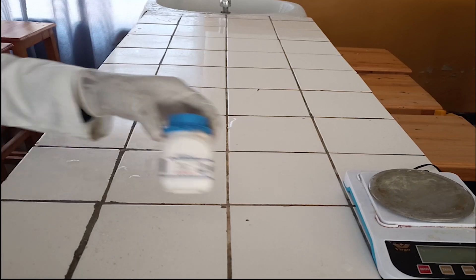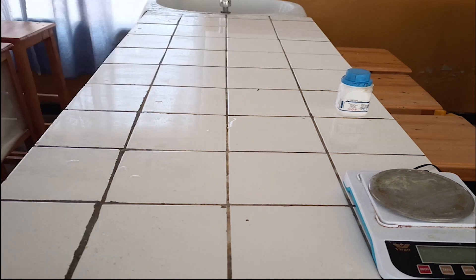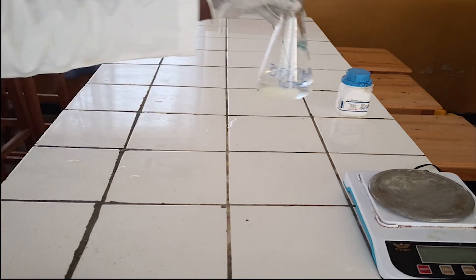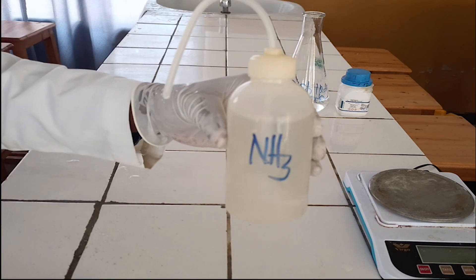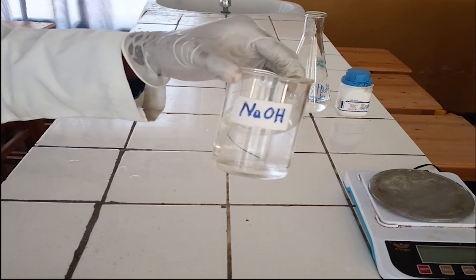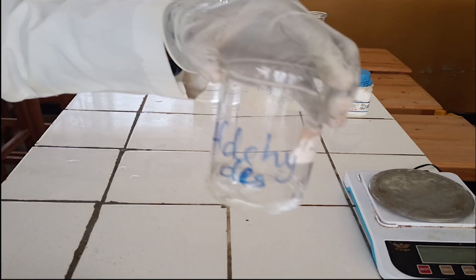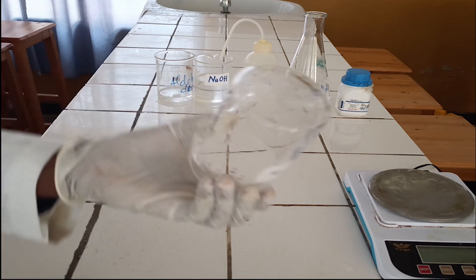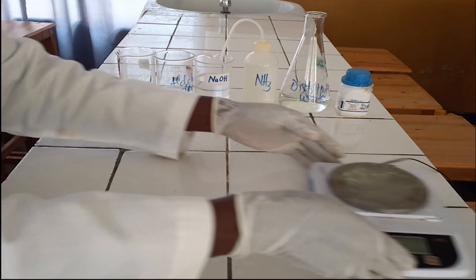Chemicals and Materials Required: 1. Silver Nitrate. 2. Water. 3. Diluted Ammonia Solution. 4. Sodium Hydroxide Solution with 1 Molarity concentration. 5. Aldehyde Solution. 6. Empty Beaker. 7. Electronic Balance.